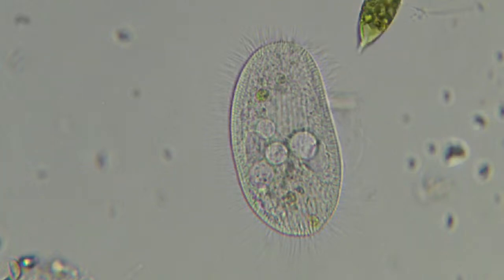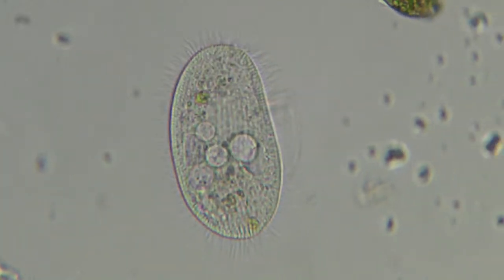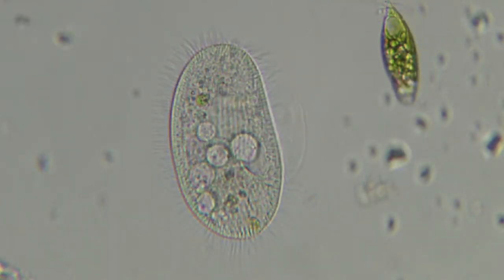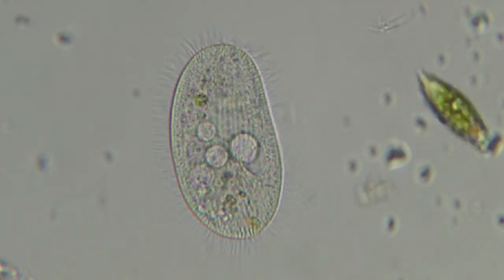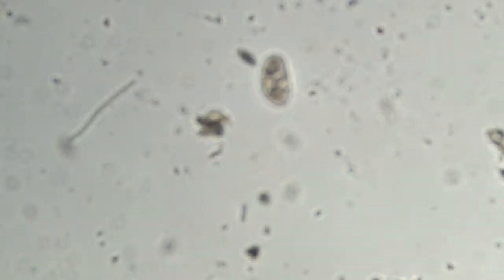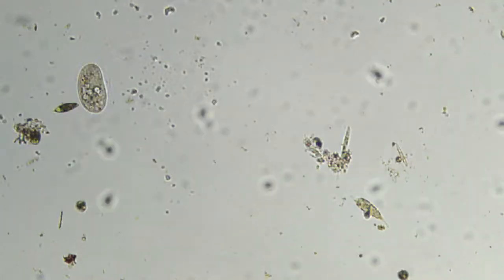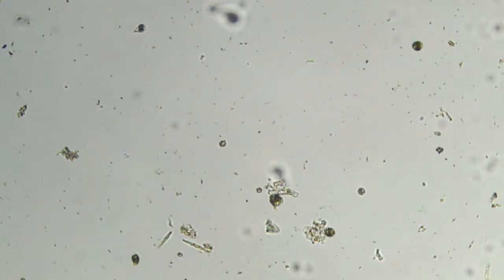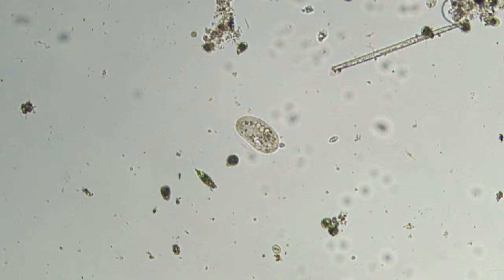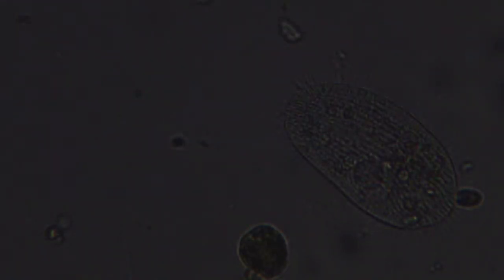There's that Euglena next door doing some investigation. Pretty cool. Let's keep looking. Some more stuff to see. I'll probably make this the last slide. I gotta go do some other stuff, but wanted to use these samples up while they were fresh. There's another one of those little guys. Lots of vacuoles in this one too.